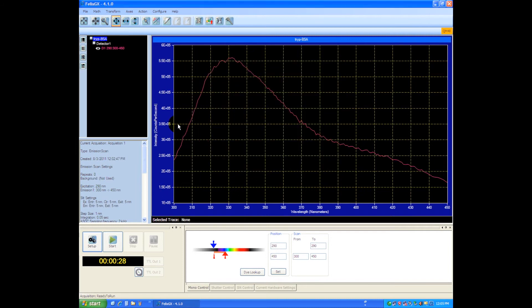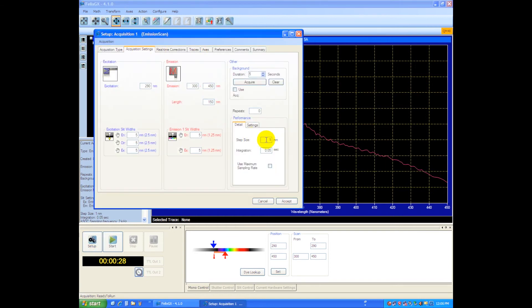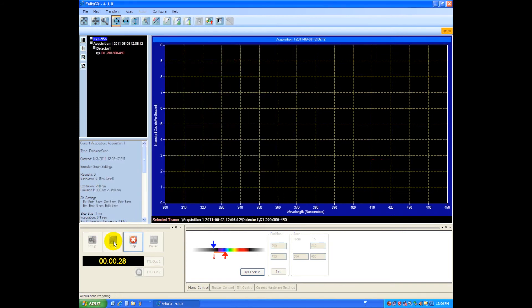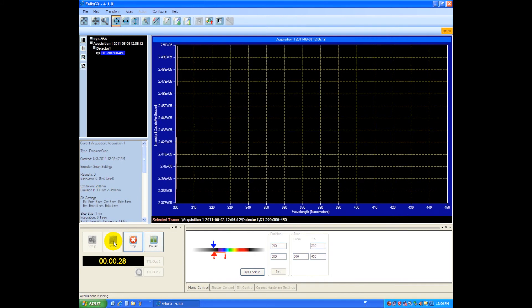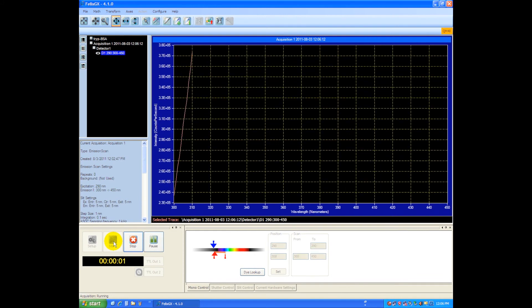If we want to improve the signal to noise ratio in the scan, we can increase the integration time. So I can simply go back to my setup, let's change that now to say a 0.1 second integration time, and then if we start the scan we'll be integrating a little longer and that's going to improve our signal to noise ratio.